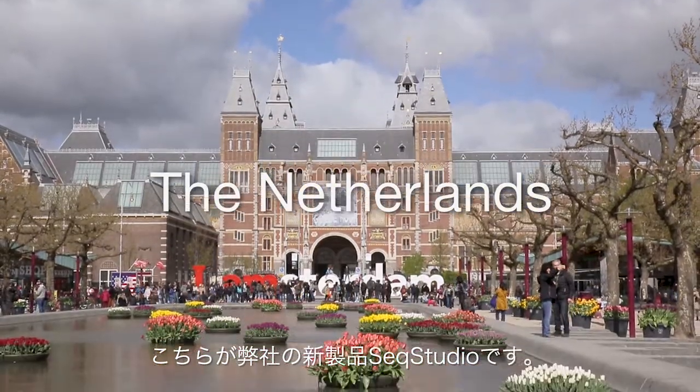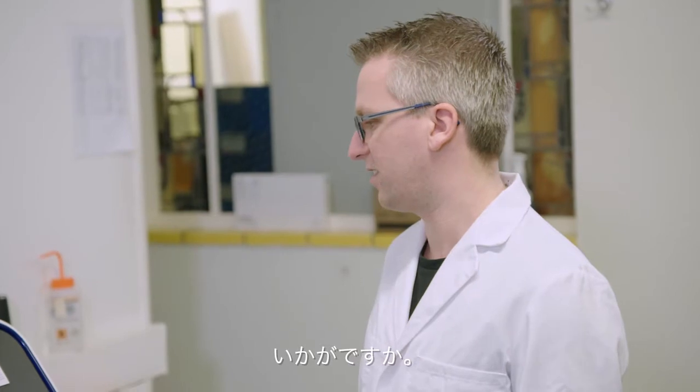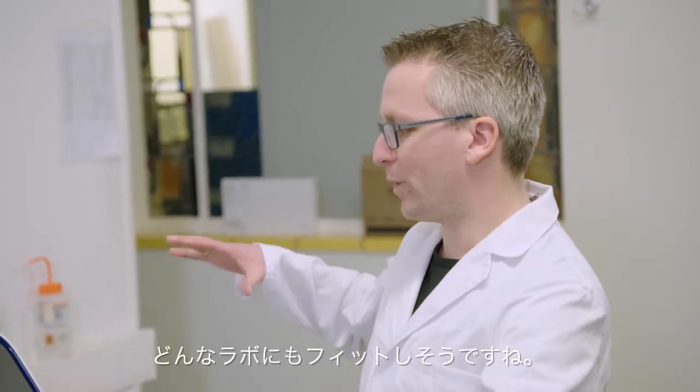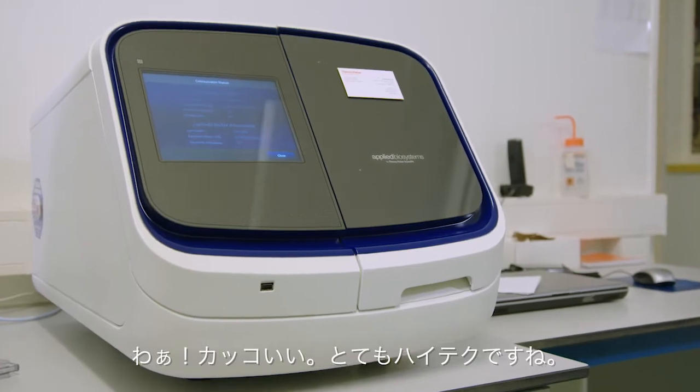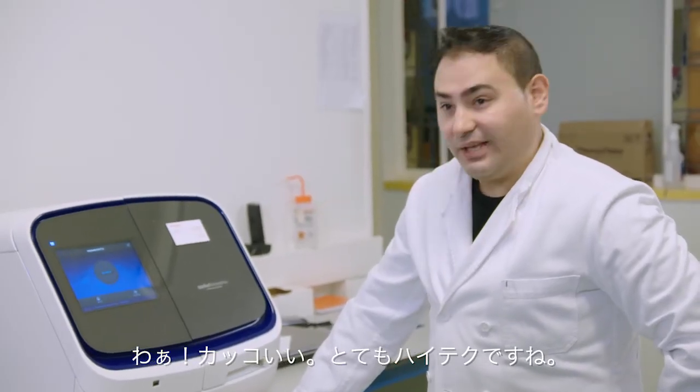This is our new instrument, the SeqStudio. What do you think of it? This fits much better in any lab, I think. Wow, it looks cool — very high-tech.